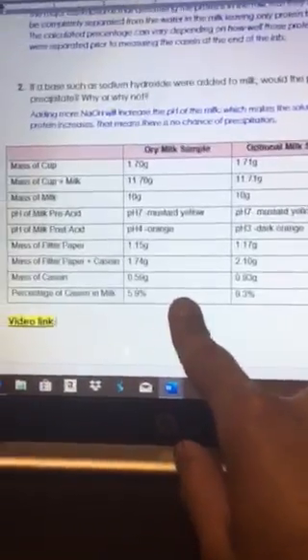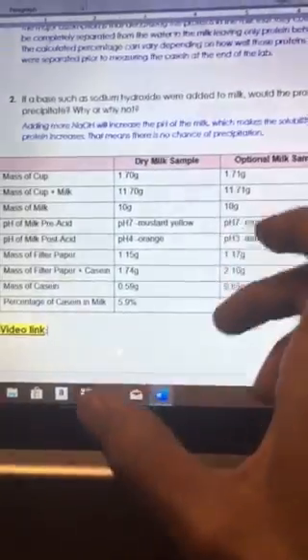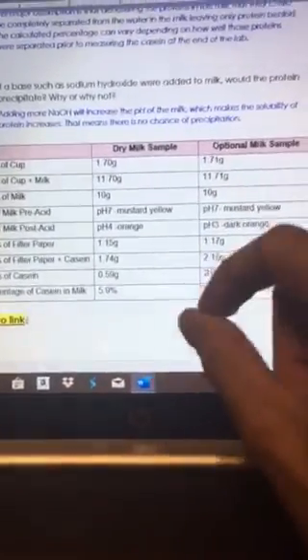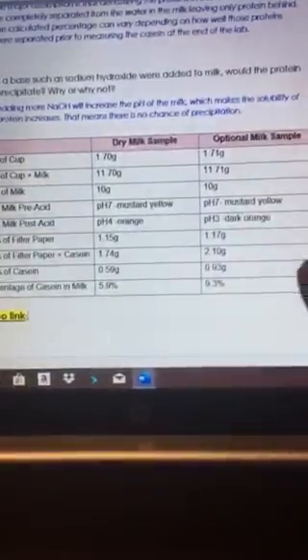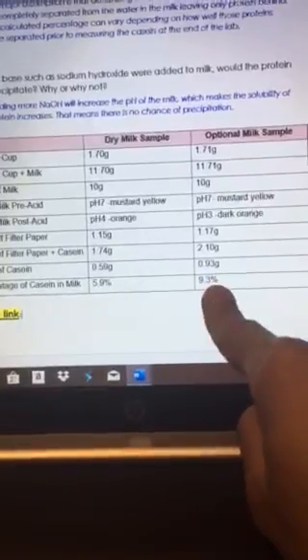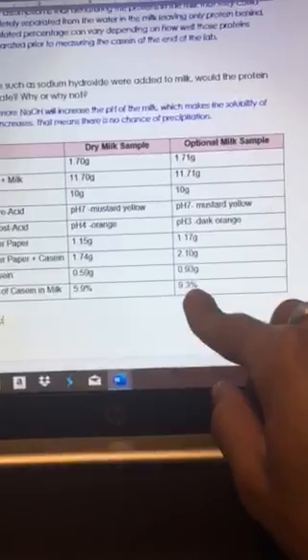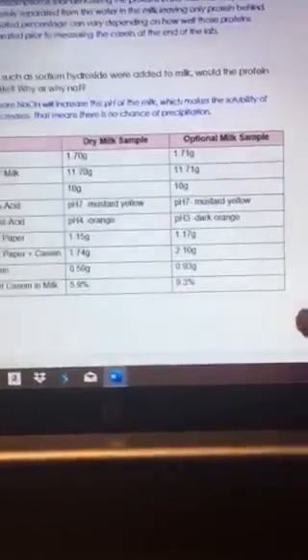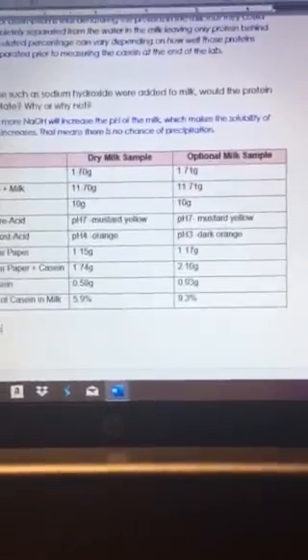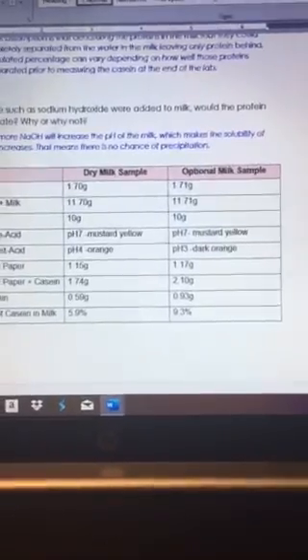This one, pretty much the precipitates that I ended up with on the filter for the dry milk sample were kind of in chunks. For the whole milk that I ended up doing for the second one, which was a lot greater, that actually looked very close to foam initially, and once it was dried, kind of like the foam that you get from whipping cream or something.